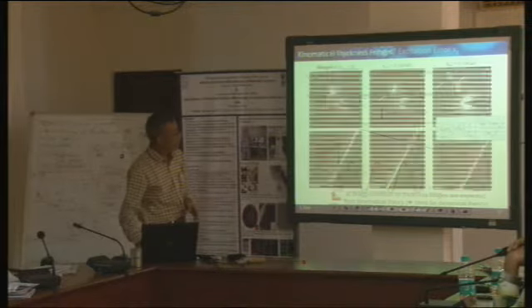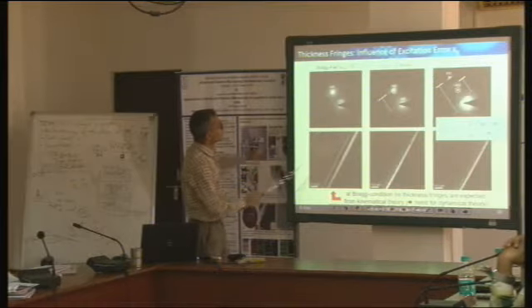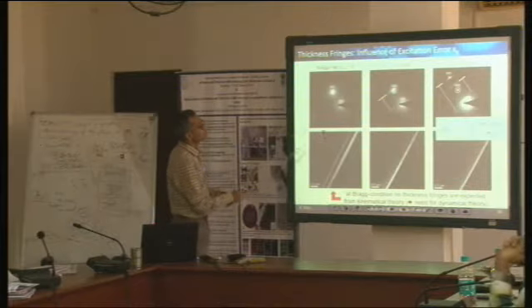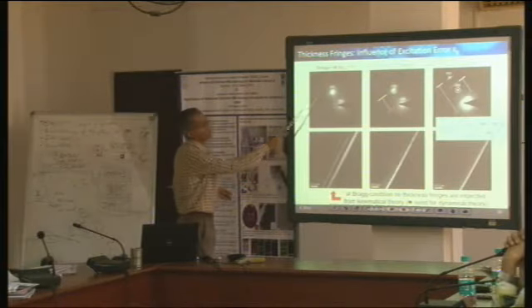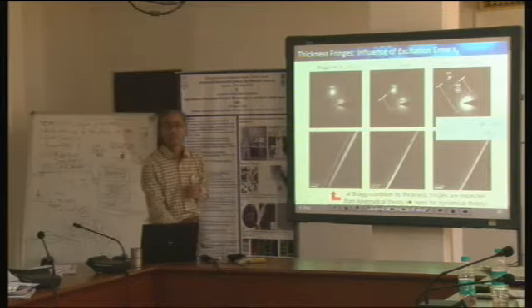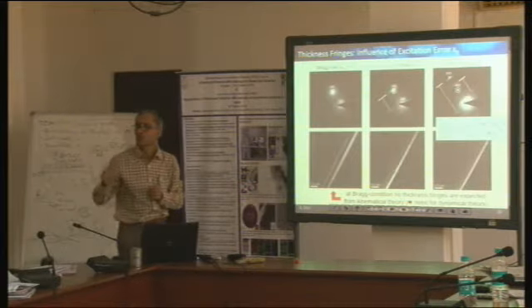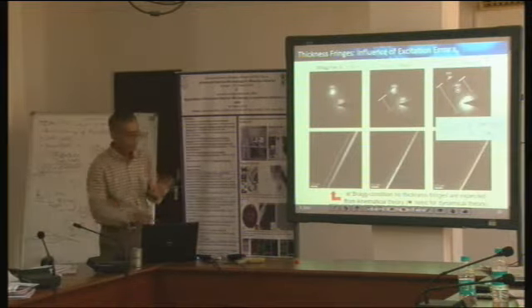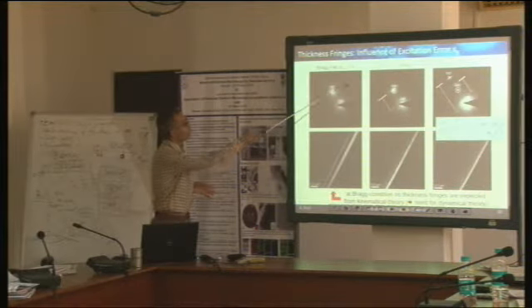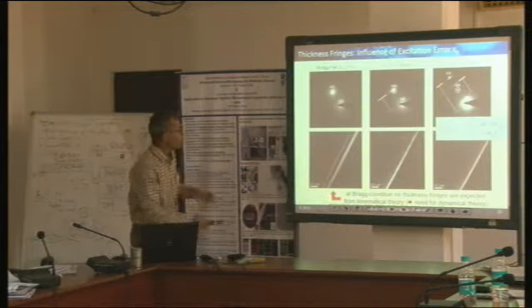And the example of that is here. This is again silicon, and we see the fringes, and here S is equal to 0. Ideally, even for thickness fringes, S equal to 0 would have failed, because at S equal to 0 we should not have got any fringes. But we do get fringes. Here is a perfect S parameter, because that Kikuchi line is going exactly through this one, but we see fringes.